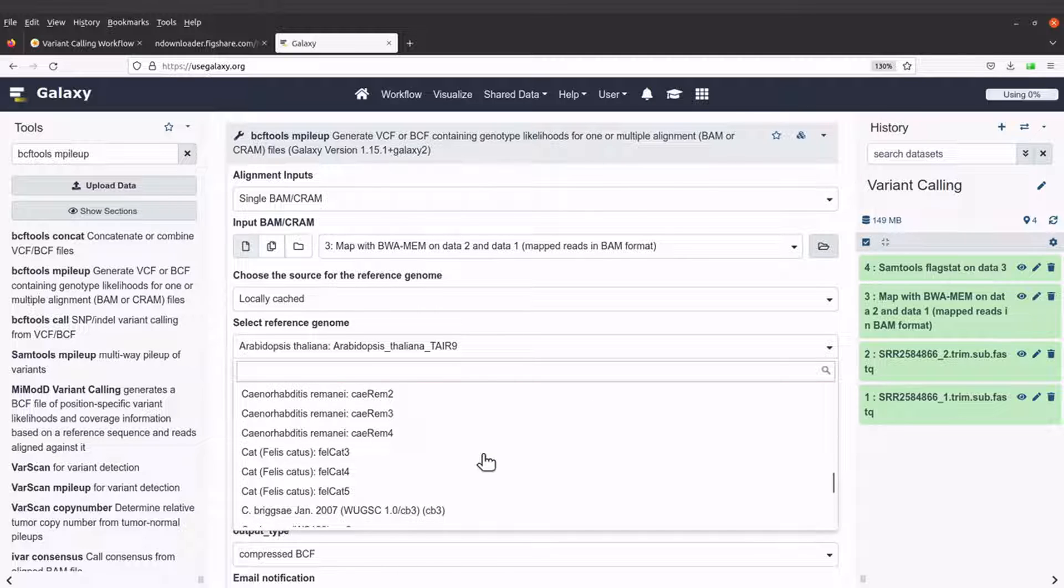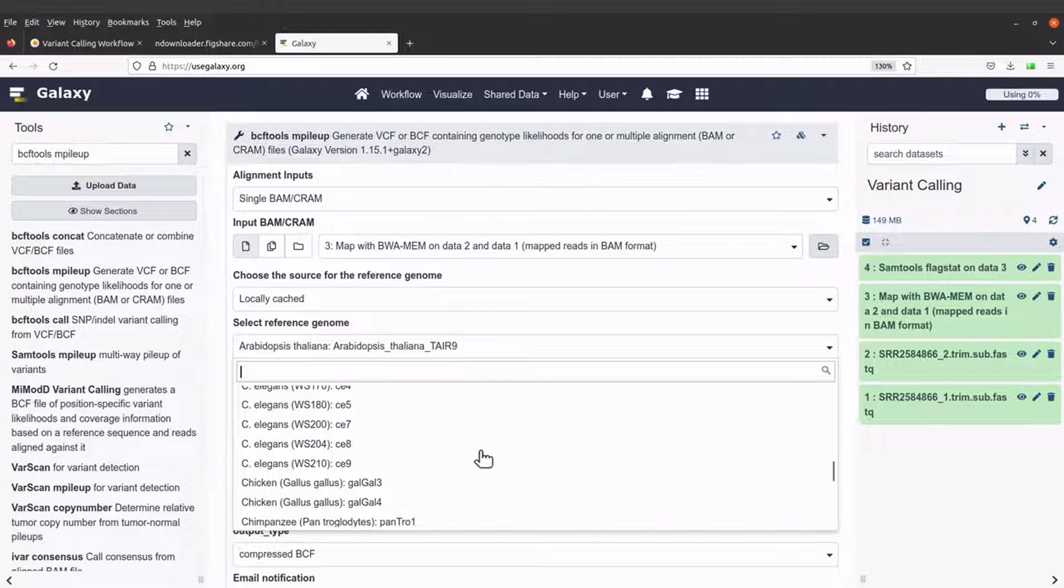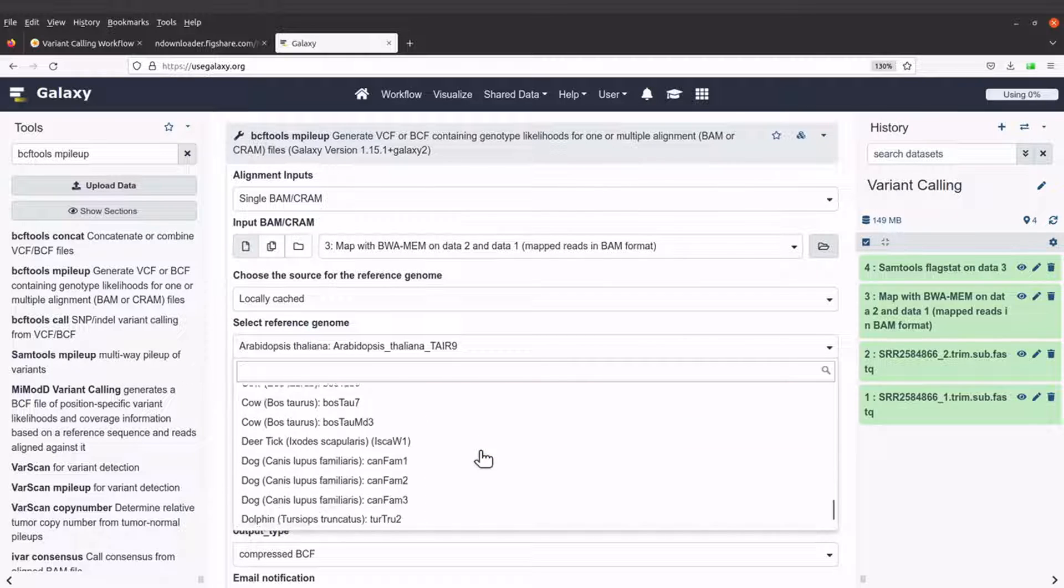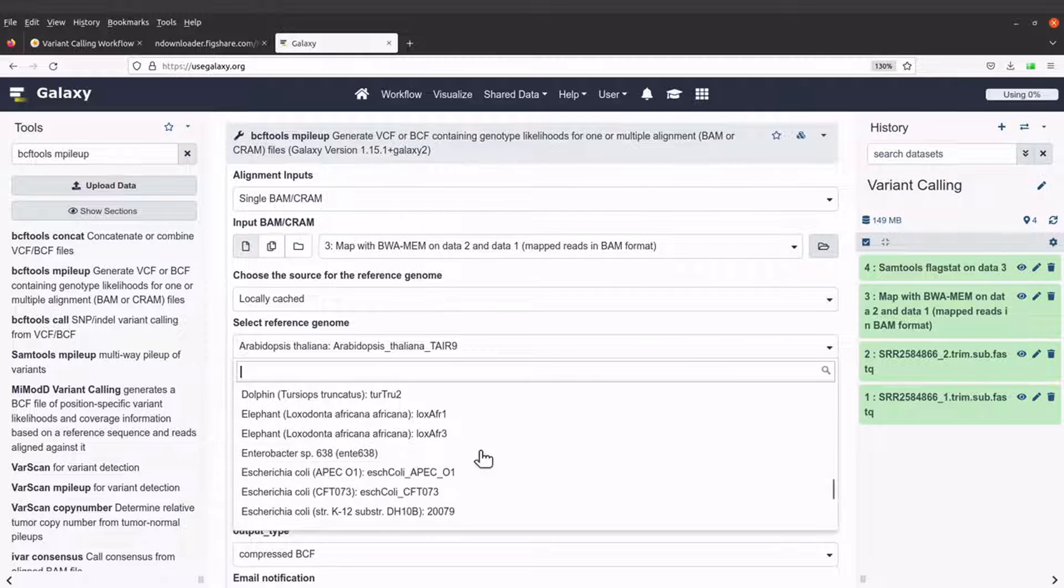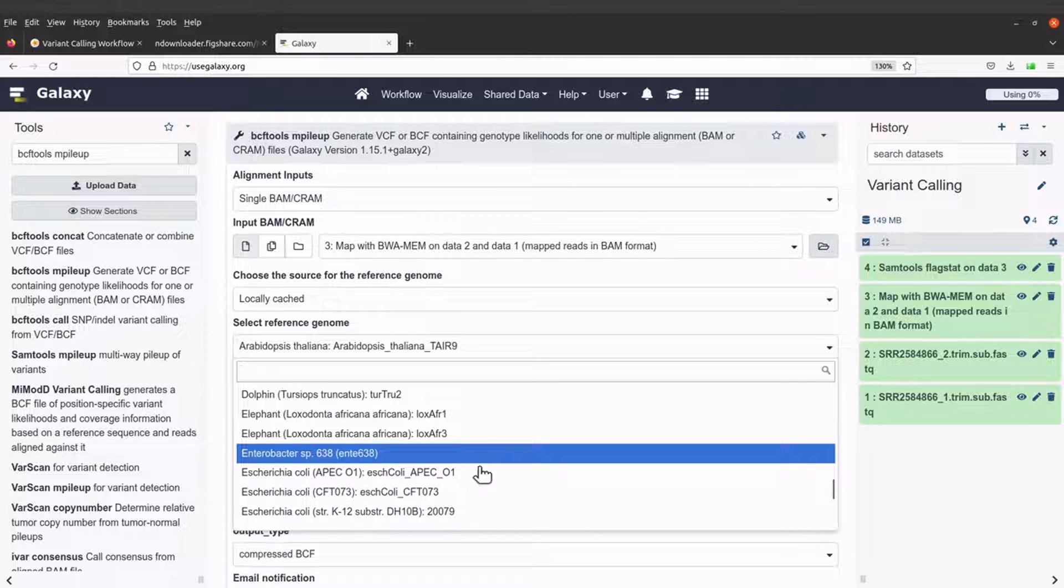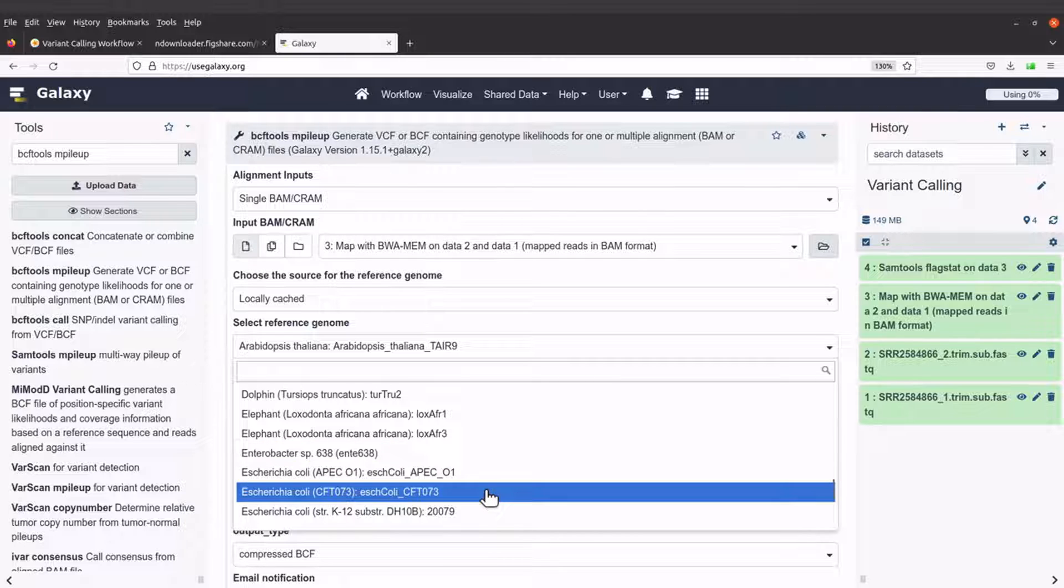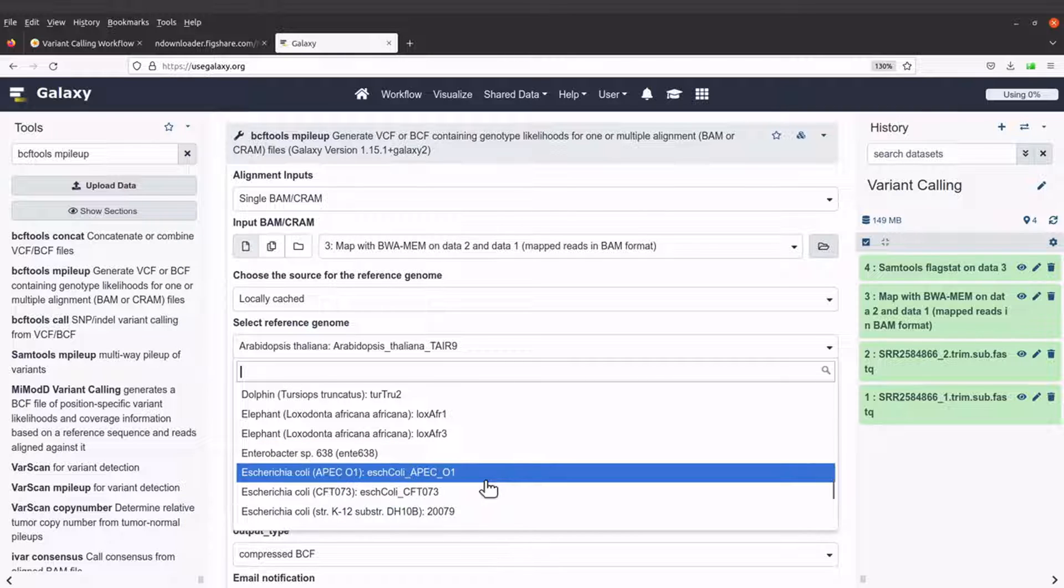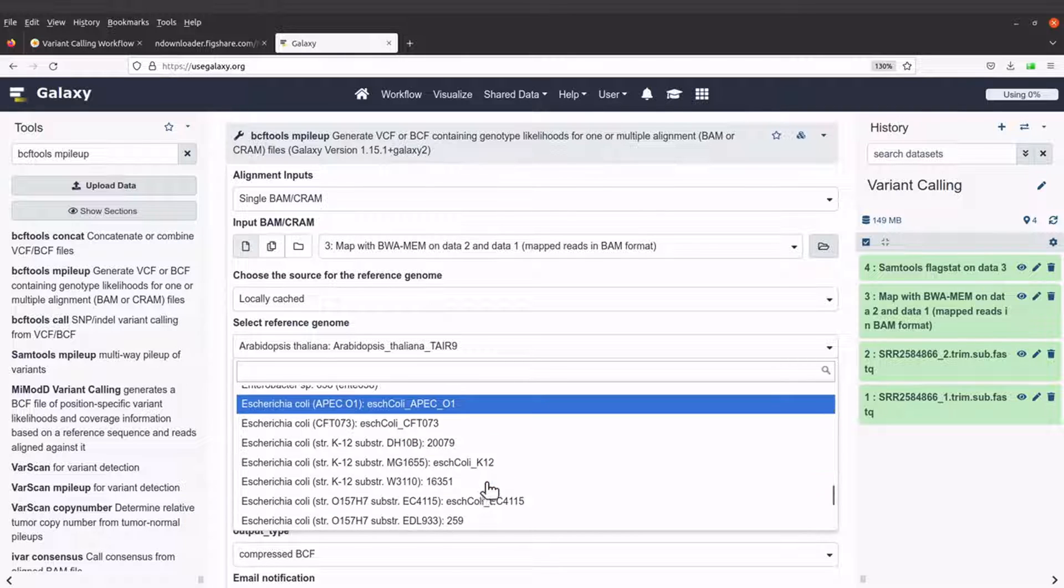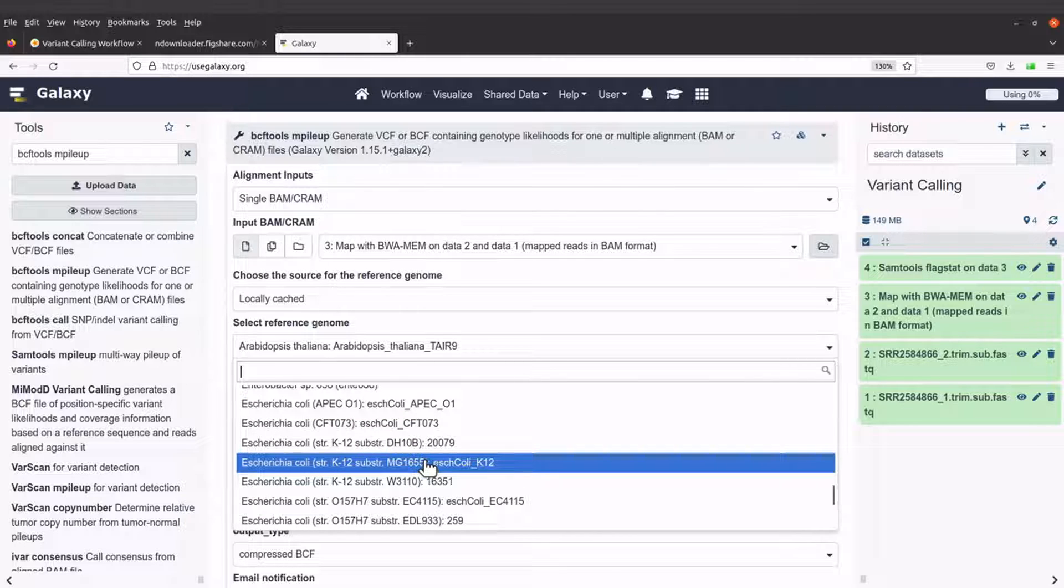So let's click and select E. coli, the one we use for the mapping. So we should find it somewhere here. This one. So let's use this one.